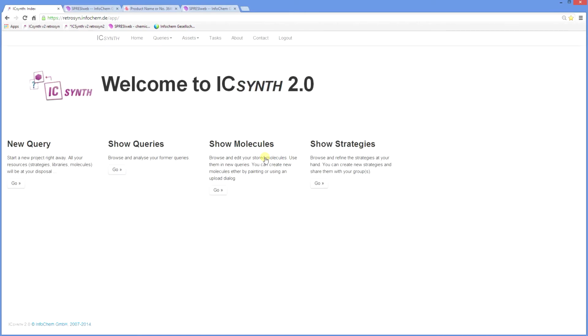After logging in, you will see the home screen with the main commands across here. New Query is for starting a new synthetic analysis. Show Queries allows you to browse and analyze former queries. Show Molecules allows you to browse and edit saved structures and use them in new queries. And Show Strategies is an advanced feature that will be discussed in another tutorial. Along the top are the menus containing additional options and commands.